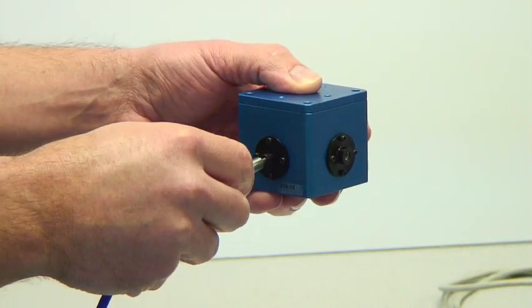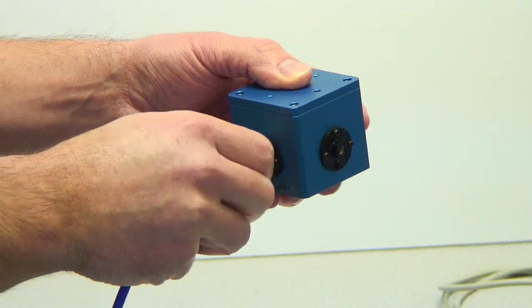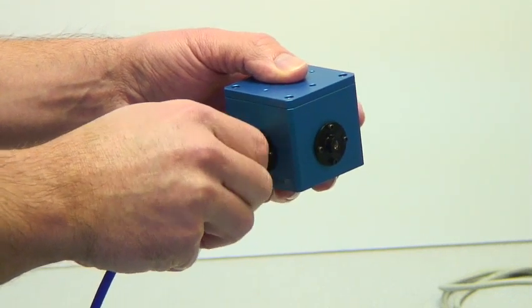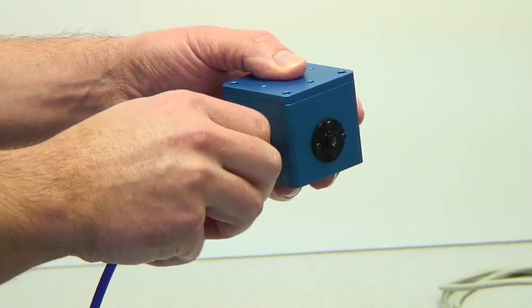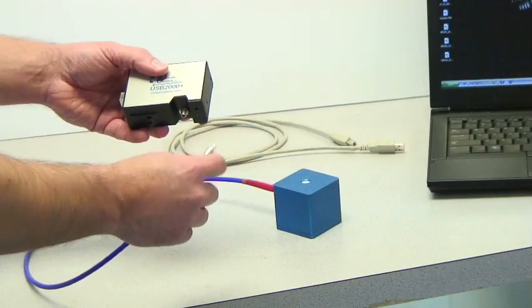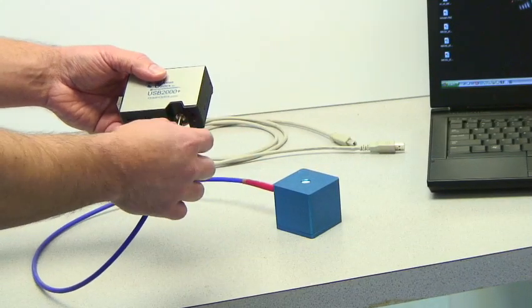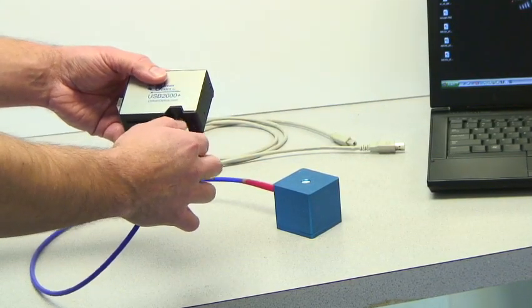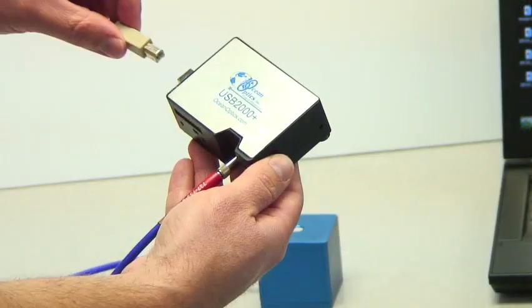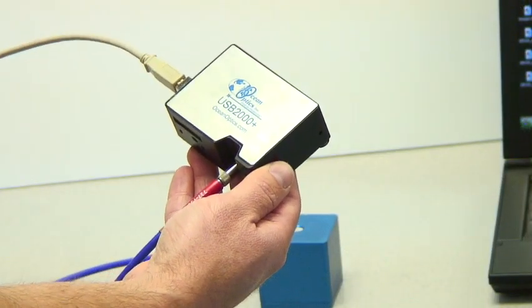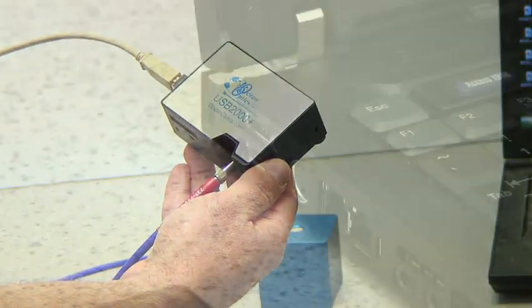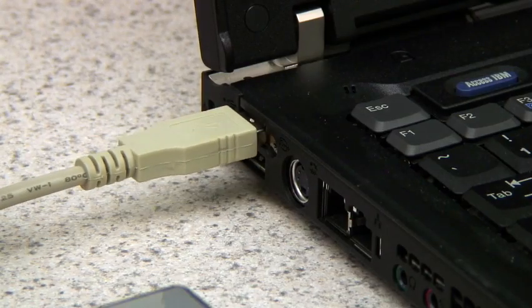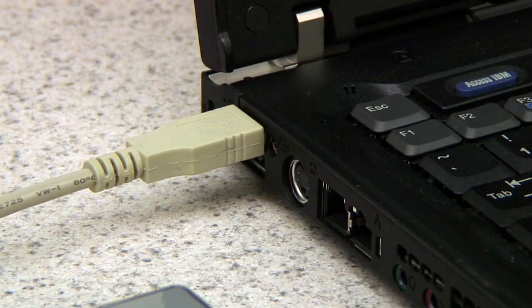Next, connect one end of the patch cable to the SMA connector on the integrating sphere. Connect the other end of the patch cable to the SMA connector of the spectrometer. Make sure that the USB cable is connected to the spectrometer and the USB port on your PC. This completes the setup.